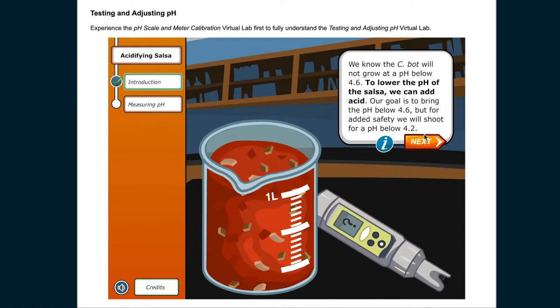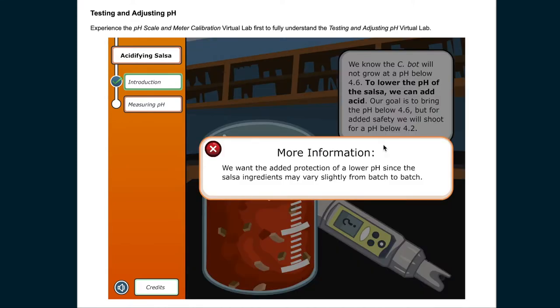We know that CBOT will not grow at a pH below 4.6. To lower the pH of the salsa, we can add acid. Our goal is to bring the pH below 4.6, but for safety, we will shoot for a pH below 4.2. We want the added protection of a lower pH since the salsa ingredients may vary slightly from batch to batch.